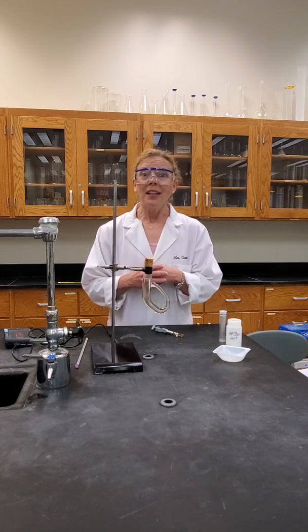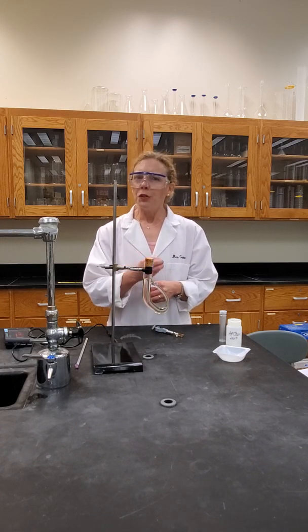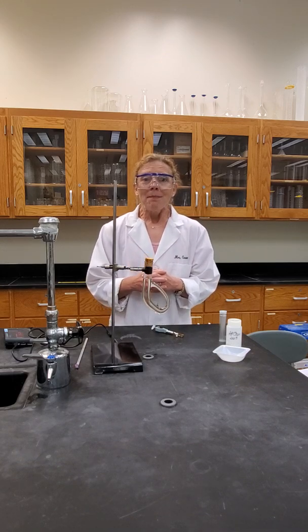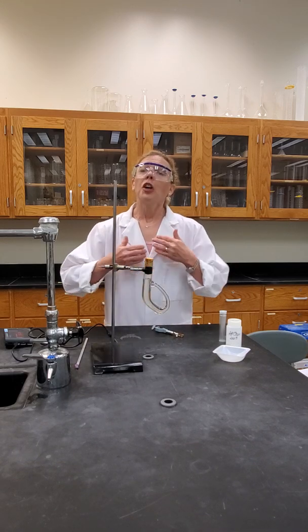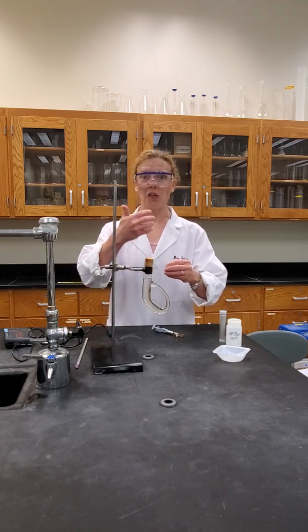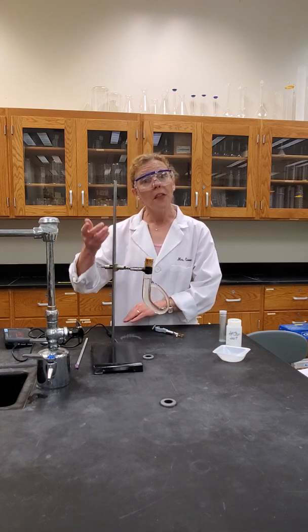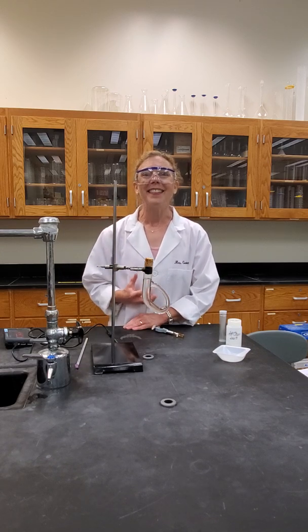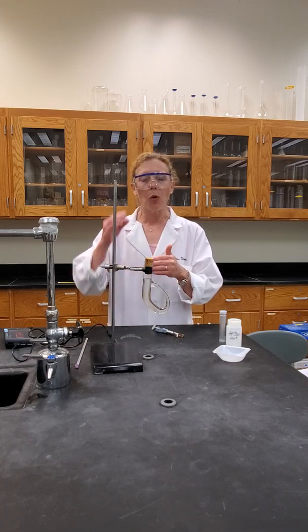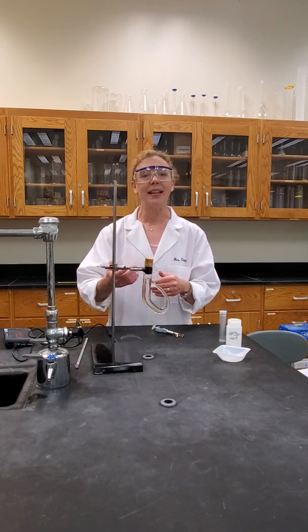Many times a chemist synthesizes a compound, or you do a reaction and you produce a compound you're pretty sure you know the identity of. But how do we prove that? Determining the melting point experimentally and then comparing that experimental melting point to what is theoretically predicted gives us evidence that allows us to say we made what we think we made. So throughout this year, we'll often measure melting point as a way to confirm the identity of a compound.